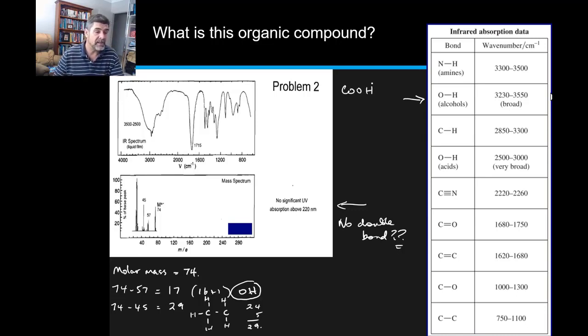So I can confirm that by saying, okay well, that sort of broad region around where I expect it is where an OH appears. But the hairy beard one is more an indicator of the carboxylic acid group than the OH group. So of course, one of the really important things I can do is I can look at where the carbon oxygen double bond is. And that sits in that 1680 to 1750 region. And as we've already looked at in a previous example, there it is right there. So that is actually confirming to me the presence of the COOH group because I've got that hairy beard. So I've got the broadness up where the OH group is, but I've also got the presence of that C double bonded O.